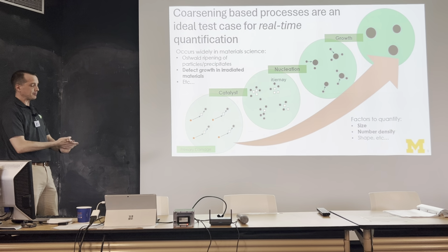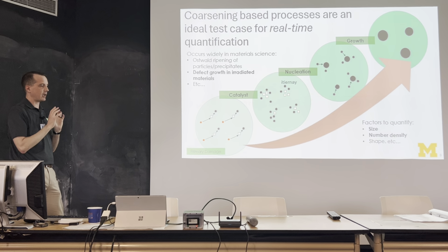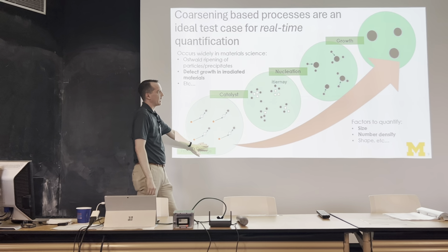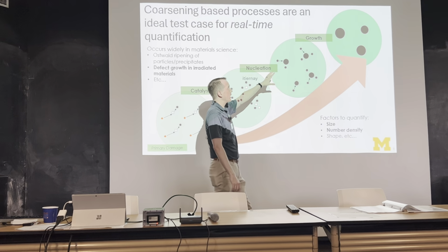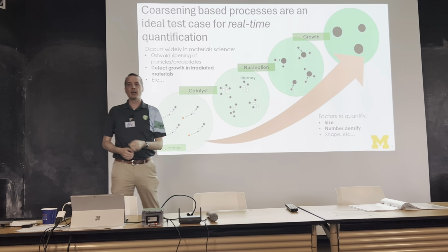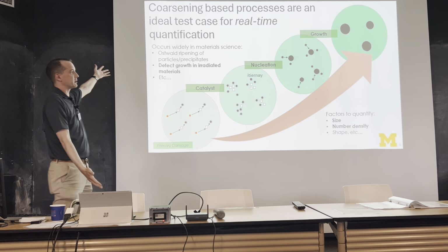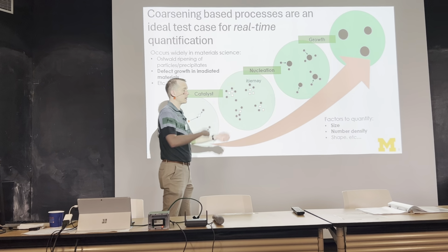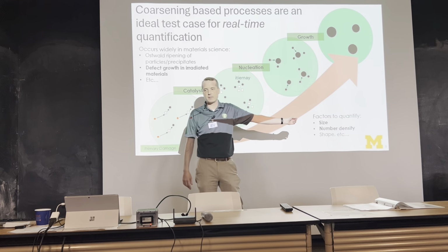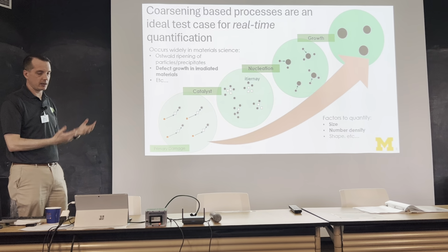And it turns out that in this research and in this work that the microscopy and image analysis works pretty well, because we're starting down here with your primary damage and it's scaling as well. And what we're trying to look for is the growth of those voids. Do they come together? Do they split apart? How does that work? And then you start adding in the different alloys and the different material compositions, and you start getting this matrix of information to decide, again, is it good material or bad material? And what we're ultimately looking for in our information is sort of the size, your number densities, and your shapes of those damages or those defects in your materials.